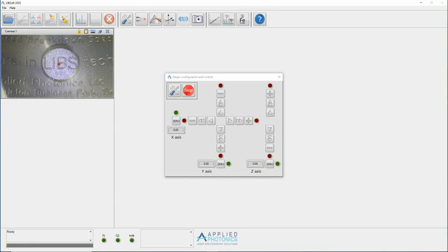Controls are available to jog the stage forwards or backwards by a fixed distance, move the stage continuously forwards or backwards, either slowly or more quickly, and to zero the displayed stage position.